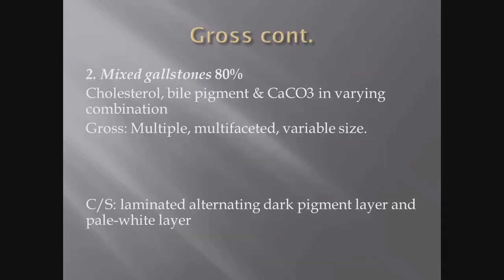The mixed gallstones constitute 80% of the cases of gallstones. They have cholesterol, bile pigment and calcium carbonate in different proportions. Upon gross picture, they show multifaceted and variable sized gallstones, and their cut section shows laminated and alternating dark pigment layer and pale white layer.